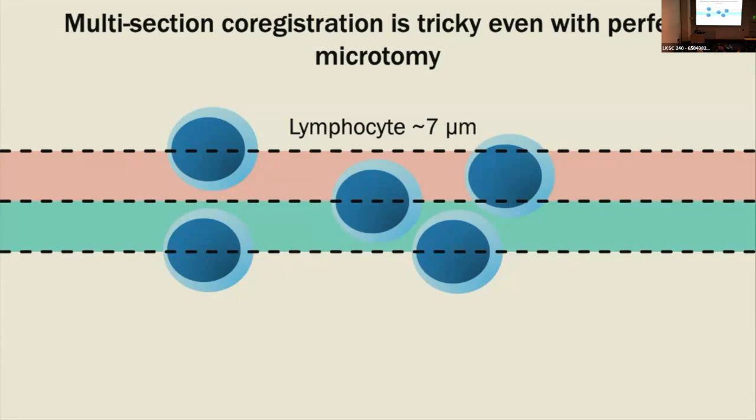That way the formalin diffuses in from both sides, at about 1 millimeter per hour theoretically. So it should take at least 3 or 4 hours for that little thin piece. And a lot of the time it's sitting there for 8 hours, because it's going to sit in formalin until it gets to the tissue processor a lot of the time.